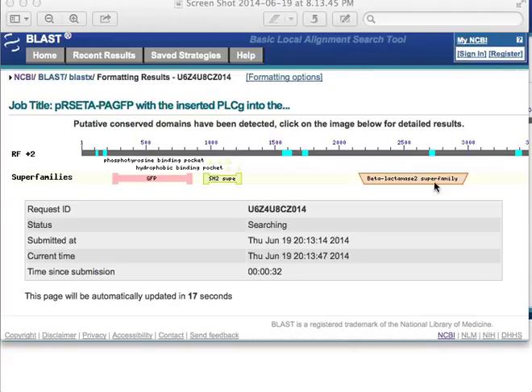The hard thing here is designing the primers with the restriction site that you want and then changing those primers. The left-hand primer is not so bad, but the one on the right can be confusing. So you have to go through very slowly and step by step. First, take the primer, then take the reverse complement, and then add in the restriction site.